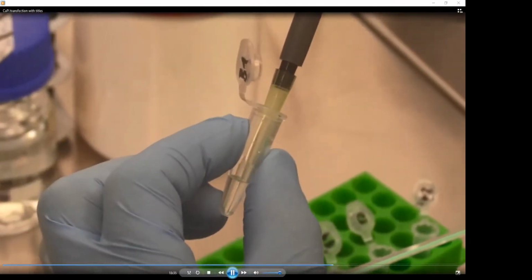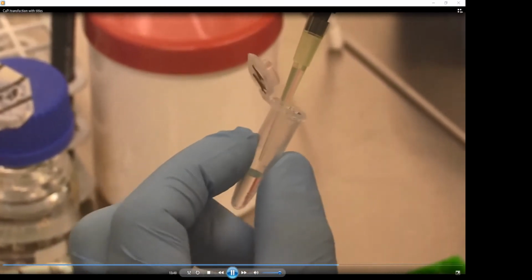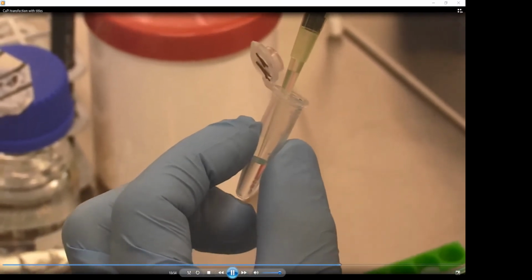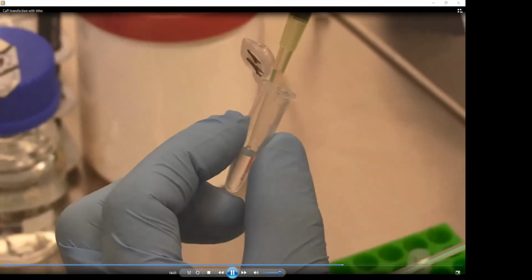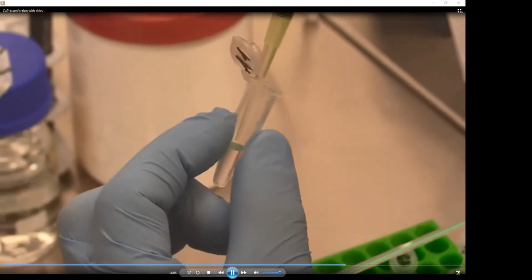So you have to collect all your mixture of DNA calcium chloride and then add it to HBS, once again dropwise. What you can sometimes notice is that the solution will change to turbid. It will be slightly milky, and this is something positive which may or should happen. That's the formation of the complex and can be sometimes visible.